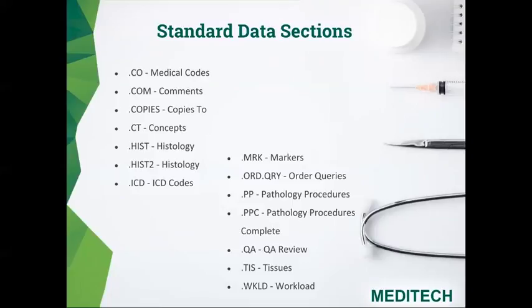The next data section is copies to. This data section is used to list the physicians who should receive reports for this specimen. You can also add doctors that should receive reports or delete those that should not be getting this report.